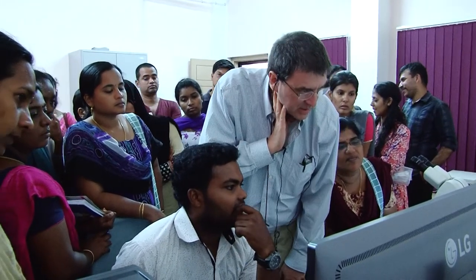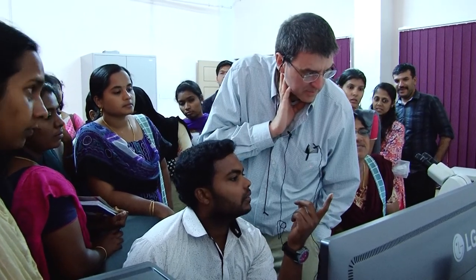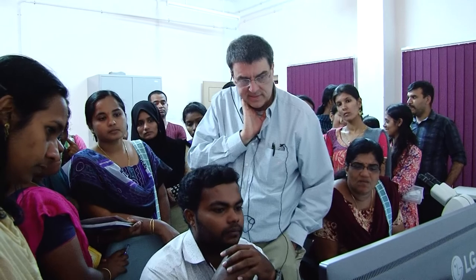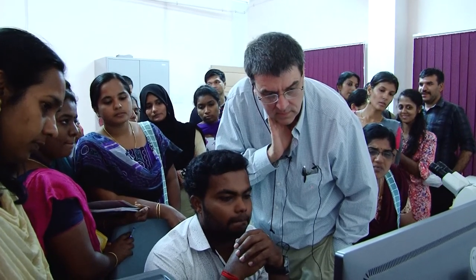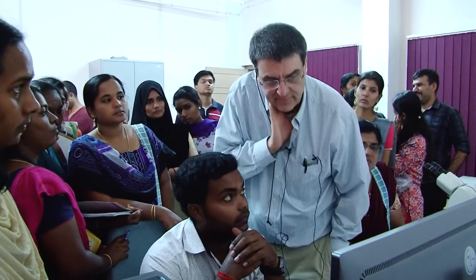Okay, so run the same thing. Run speed again. Do you want to change speed or format anything? No, that's fine. That will take some time. It'll take a little bit of time. But take a look at this quality. Okay, now let's see if the frame average helps. Now on this confocal, I'm not sure if it does it on the fly or does it afterwards.